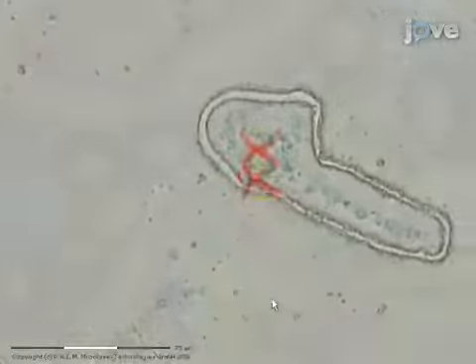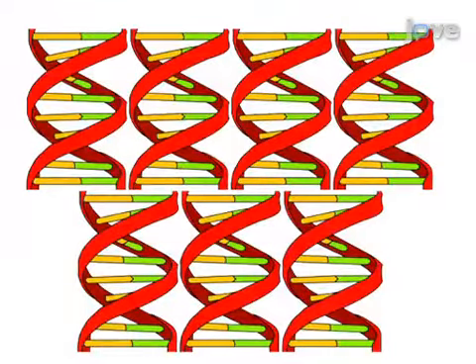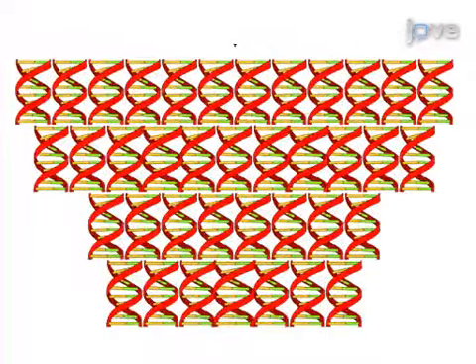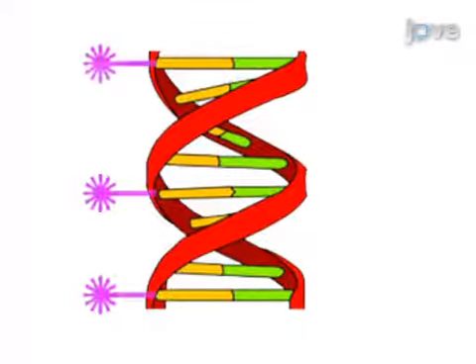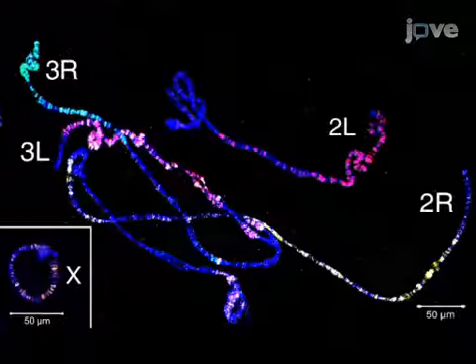The third step is to isolate DNA from the microdissected sample and amplify the DNA using 2 rounds of whole genome amplification. The final steps are to label the amplified DNA and to use them in FISH experiments. Ultimately, results can yield copious fluorescently labeled DNA for a region of interest.